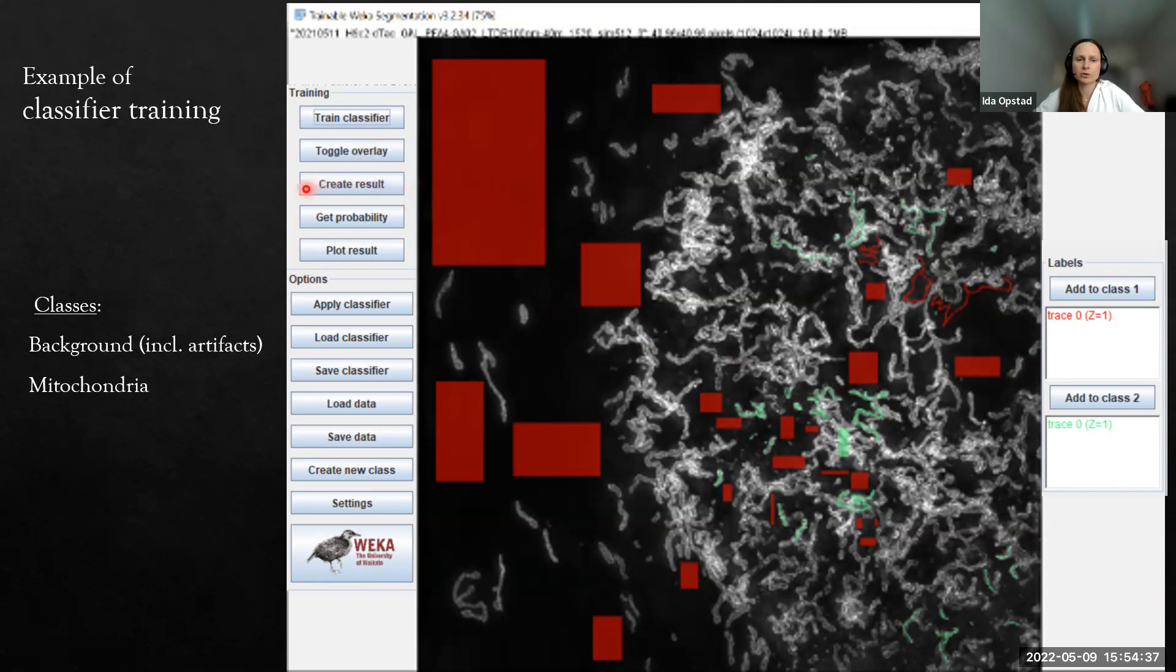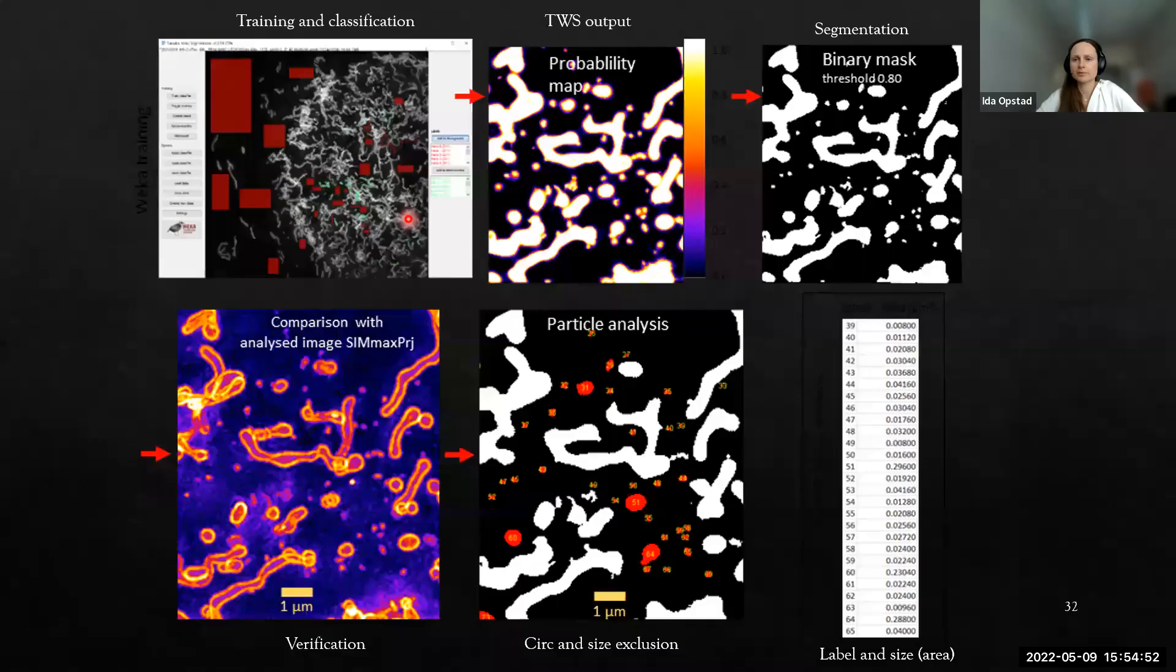If you just use create result, it will take 50-50. But I rather use the probability map because then I could change the threshold accordingly so that it made sense compared to the images. I did the training and then I get a classifier and apply it to the other images and I get a probability map out.